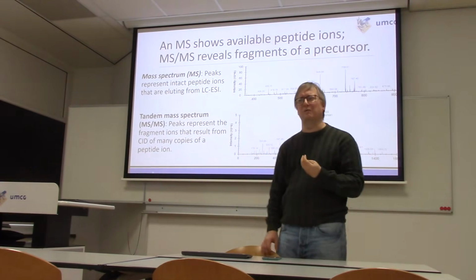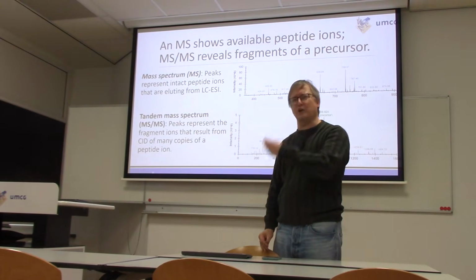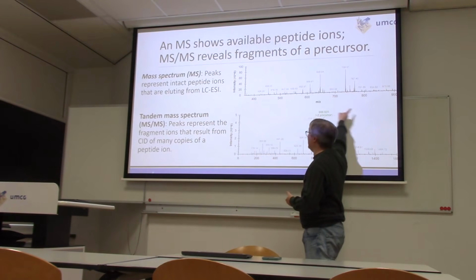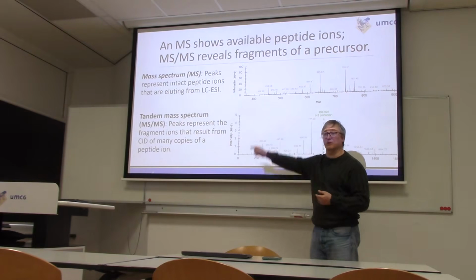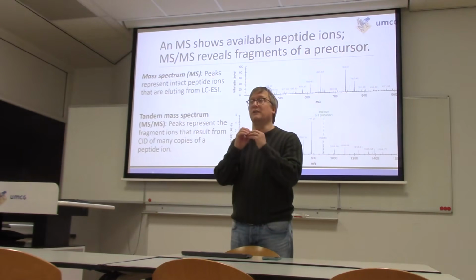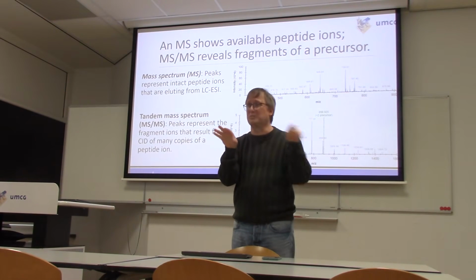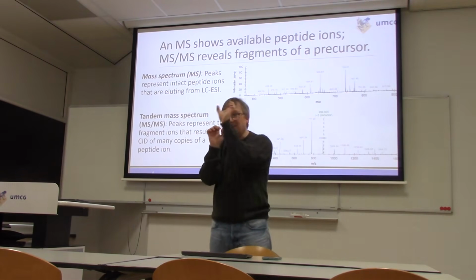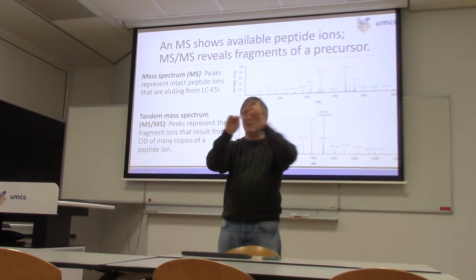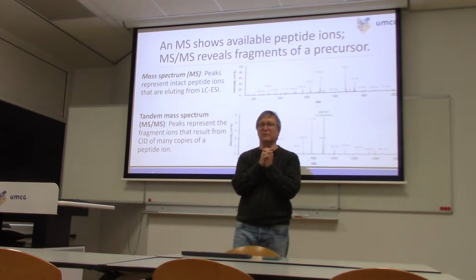But we often speak of these ions as though we have such a clear notion of what their charges are. How could that be? One of the answers here is that typically we're using high resolution mass spectrometry for the MS scan. In a case like that, the instrument has sufficient resolution that we can tell the isotopes apart. Even a single neutron is easily perceived as separate from the monoisotope when we look at the mass spectrum from an Orbitrap. It's just not a problem.